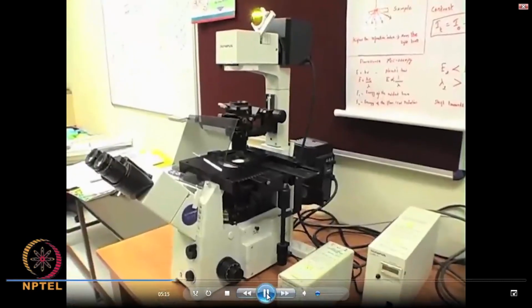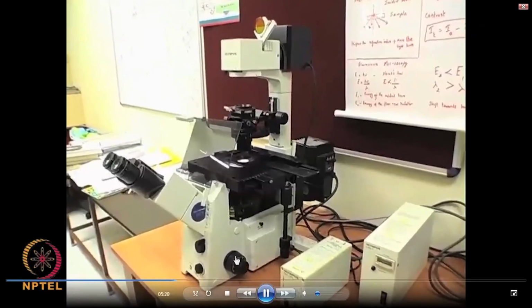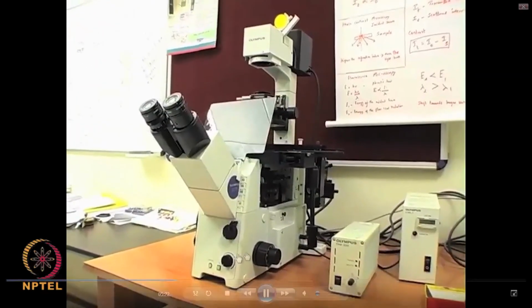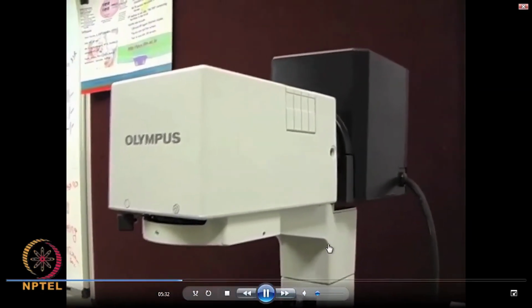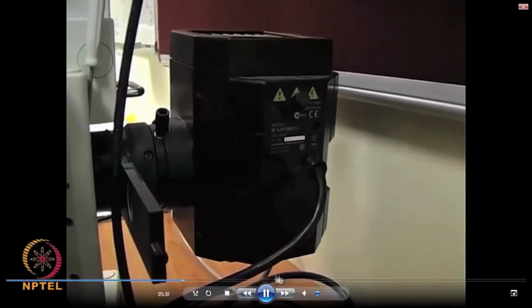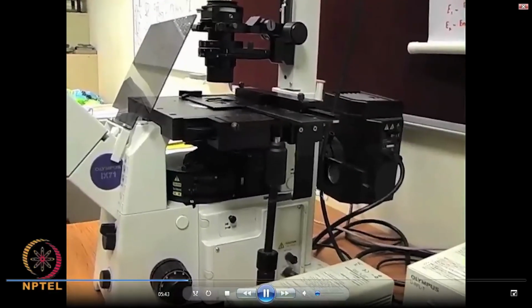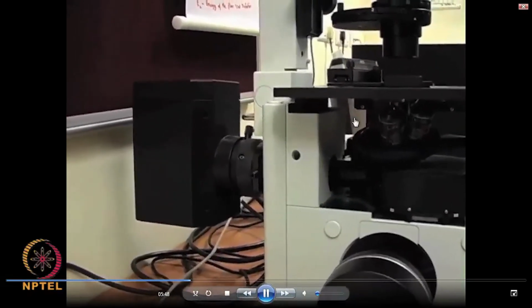What you are now seeing is another type of microscope, called the transmission optical microscope, which is very different from what you have just seen before. One is vertical, another is inverted. Here you have two types of illumination attached to it: one is a mercury lamp and the other is a halogen lamp on the top.